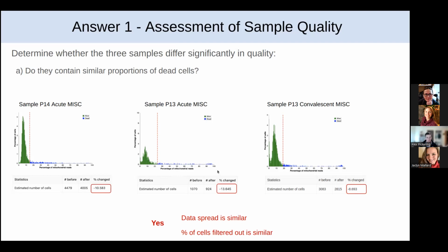And it's just removing those. In the past, people did use various heuristics where they would say, I'm just going to set it at 15 for every sample. But usually you can be comfortable with the defaults.